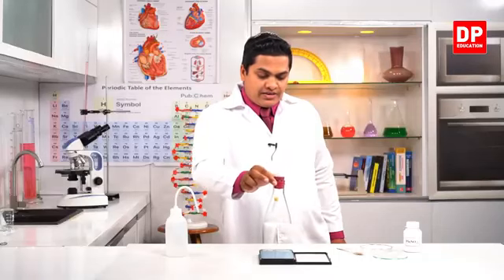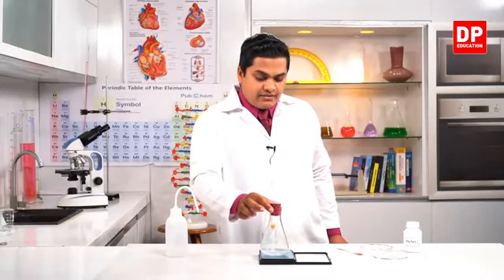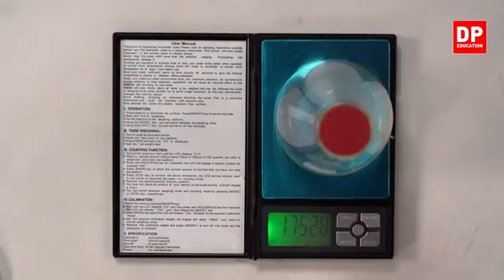Now I am going to place it on the balance and we'll see whether there is a change or not. So my dear children, once again you can observe, even though the chemical reaction has occurred within this system, and you can see that there is a precipitation inside the ignition tube, the mass of the system hasn't changed at all. The mass of the system is still 175.28.